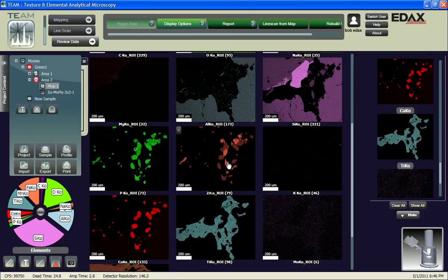And you would further see, if you look at it carefully, that the brightest part of the zirconium map overlaps pretty well with a phase that's in the silicon map. And the phase in this case is actually zirconium silicate. The mineral is zircon, ZrSiO4 is the formula. Now, in the case of the phosphorus, what is associated with the high intensity in the phosphorus map is actually the calcium. And the mineral there is apatite, and it's a calcium phosphate. And so that is what is really happening.